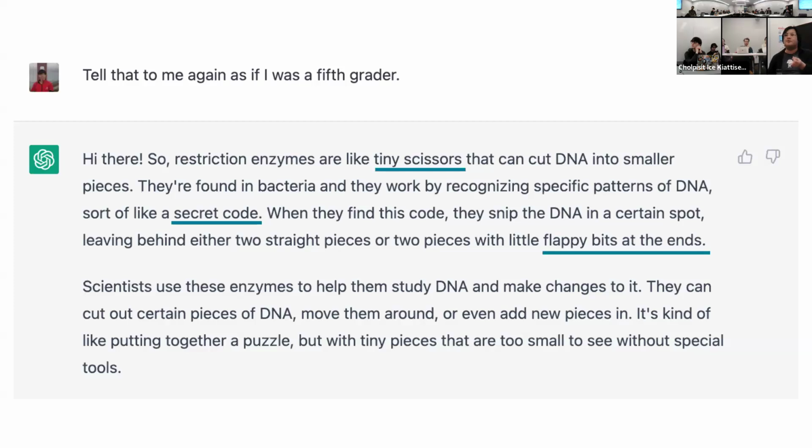And if you see something like a forensic test in the DNA test, those are also a product of the restriction digest of your DNA. So we'll show you why you will need to use these restriction enzymes across the recitation, and if that's still not convincing to you, we can talk further. I think another interesting aspect is we use them for a lot of stuff, but we're just trying to show you why there's a use case for it.